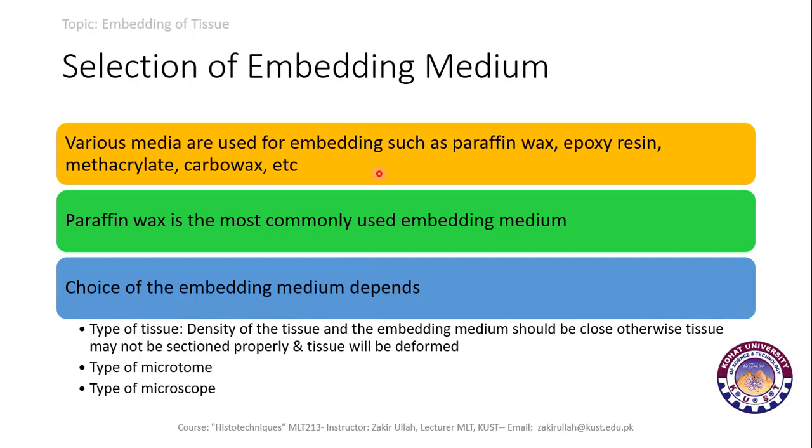Now, how can we select the embedding medium? Different types of embedding medium are available for this purpose, and one of them is paraffin wax, epoxy resin, methacrylate, carbowax.